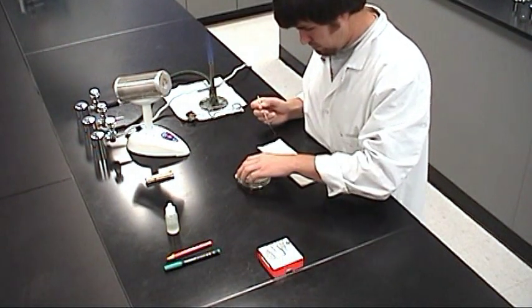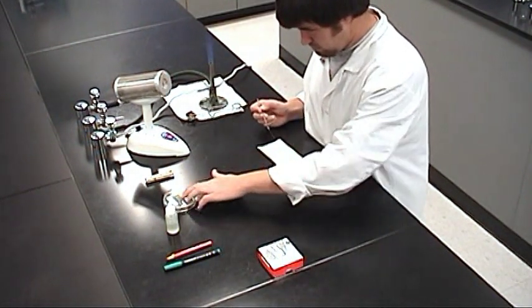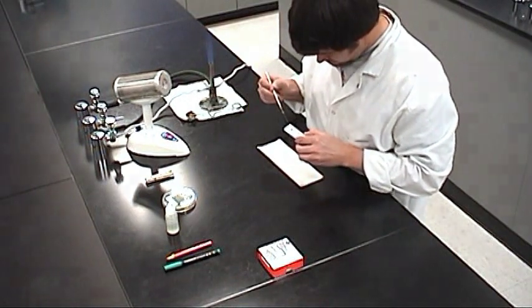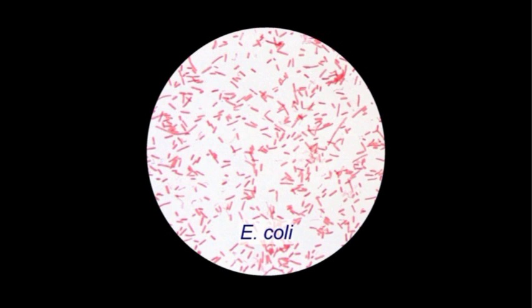Let's prepare a bacterial smear from a solid growth medium. Bacteria grown on solid media must be dispersed in water. This allows you to view them as individual organisms under a microscope.